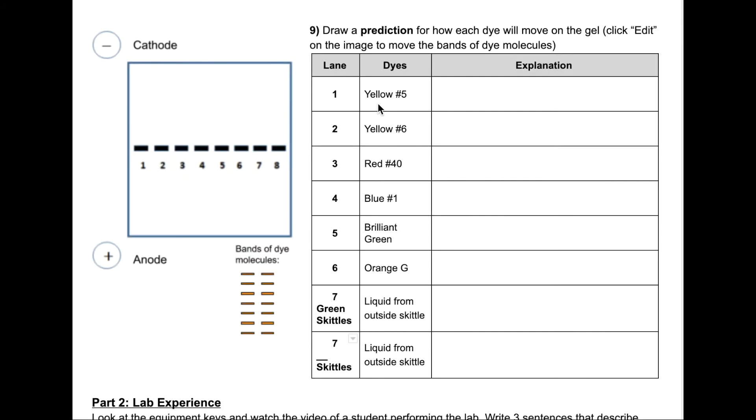Let's review the order that we're going to add our samples to our agarose gel. So for lane number 1, we're going to add the yellow number 5 dye. And we're going to add the dyes from left to right. So in lane number 2, we're going to add yellow number 6, and so on and so forth.